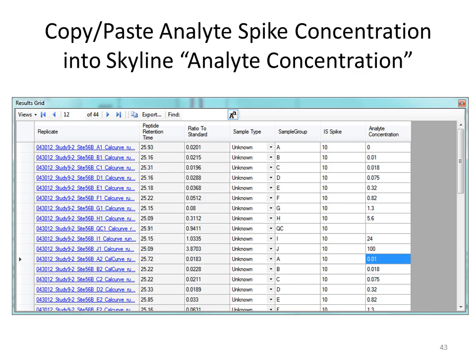All right, any questions? Okay. Are you in results grid or documents grid? Go to documents grid. View, documents grid. So then go under document grid and see reference.